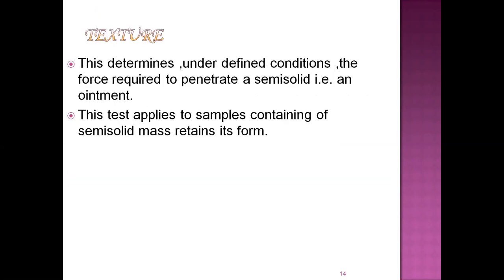And the last one is the texture. This determines, under defined conditions, the force required to penetrate a semi-solid ointment. This test applies to samples containing a semi-solid mass that retains its form.